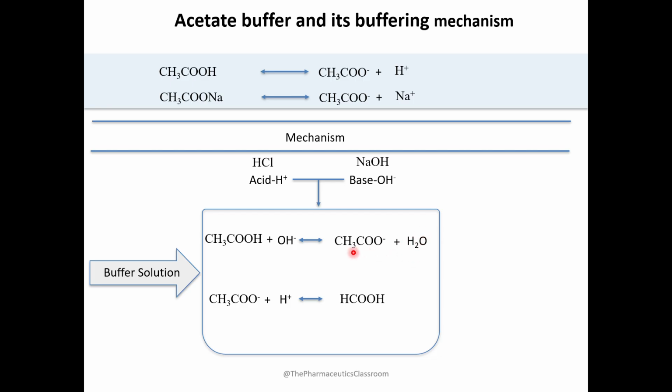Okay, so technically the base is coming here to neutralize the acid, the free H plus ion. It is reacting with the free H plus ion and forming water. And the H plus ion which is getting reduced, how will it come back? By the ionization of this acetic acid.